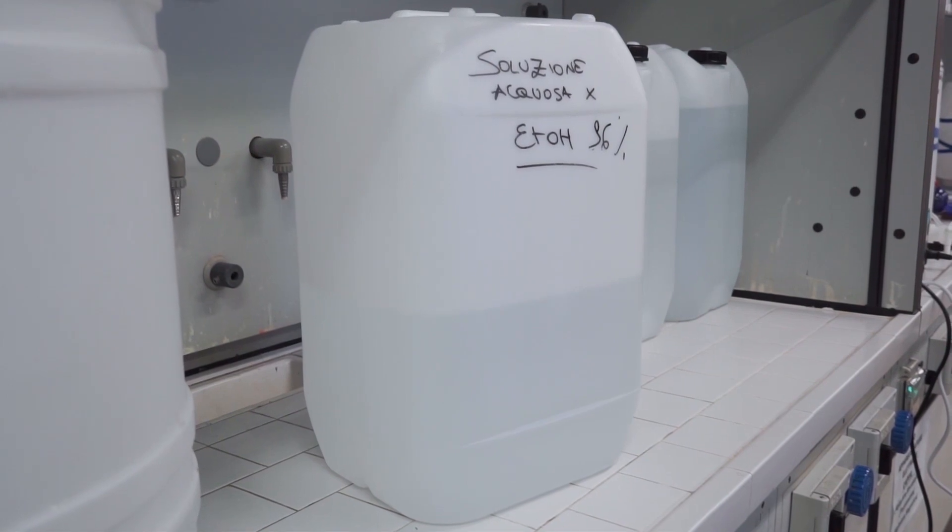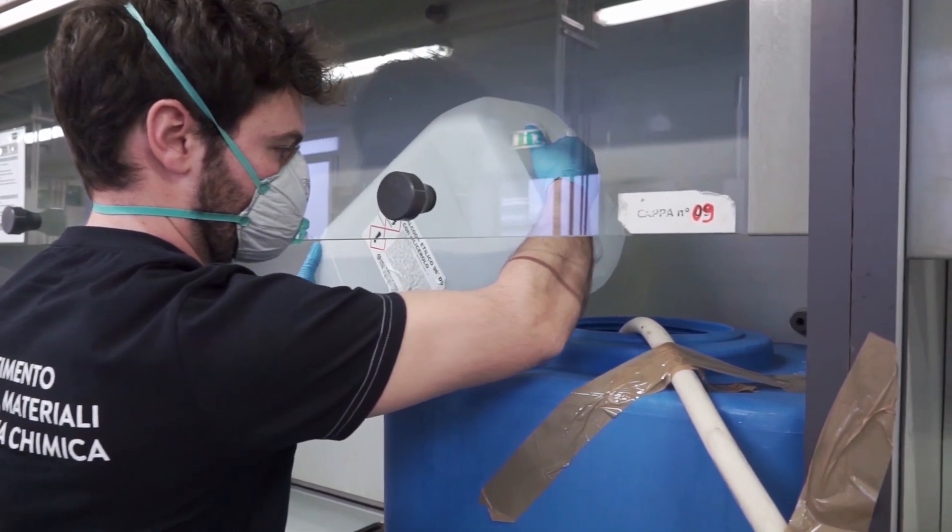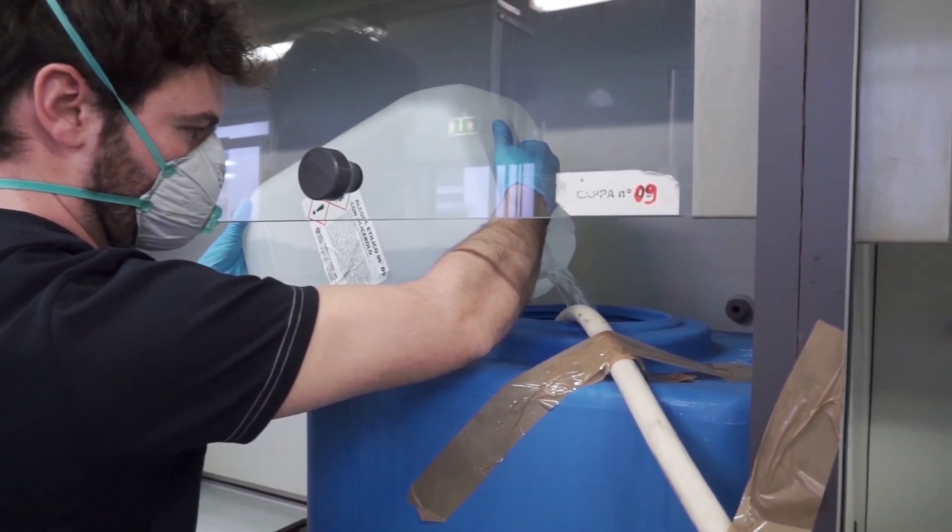In particular, the tank for the alcohol solution must be completely filled with 96% volume per volume ethanol and placed under the hood.